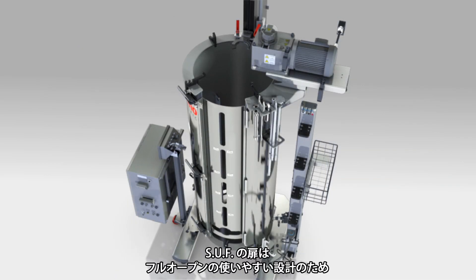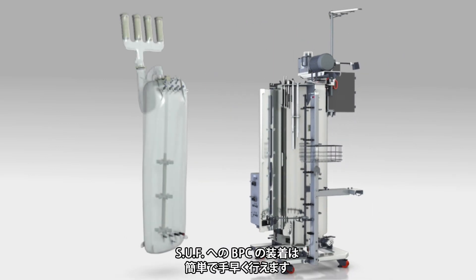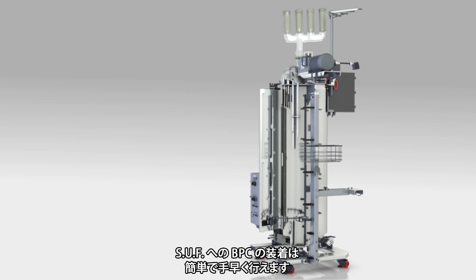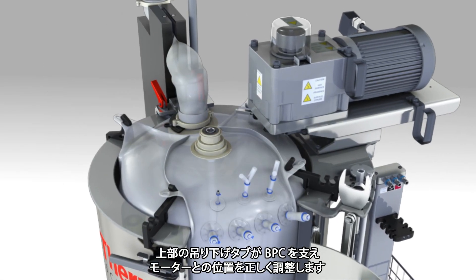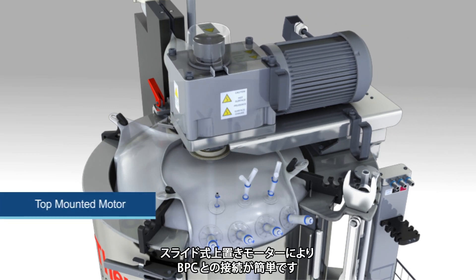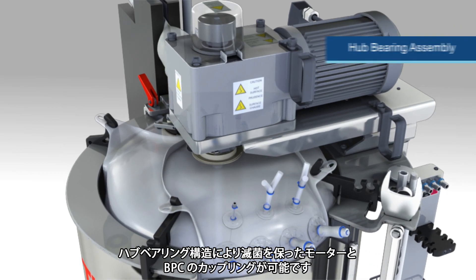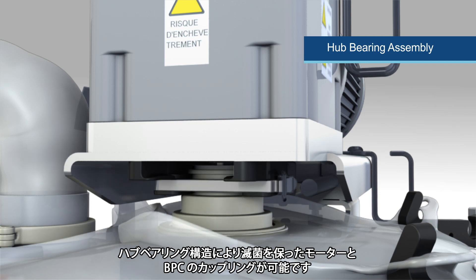Loading of the BPC into the SUF is simple and quick because the SUF was designed with an easy-to-use, unobstructed door. Top-hanging tabs are provided to support and correctly align the BPC with the motor. A movable slide top-mounted motor makes it easy to connect to the BPC.